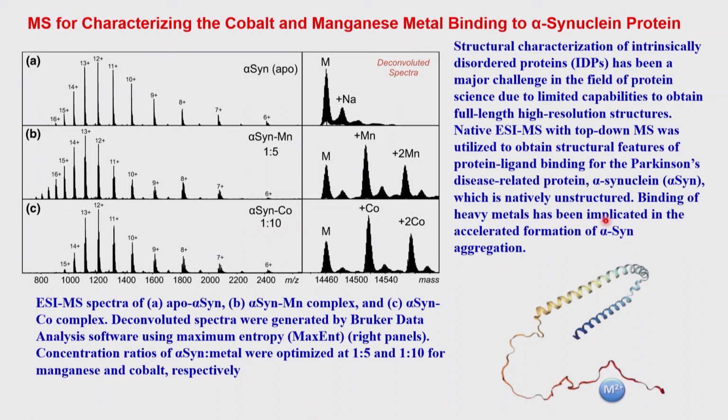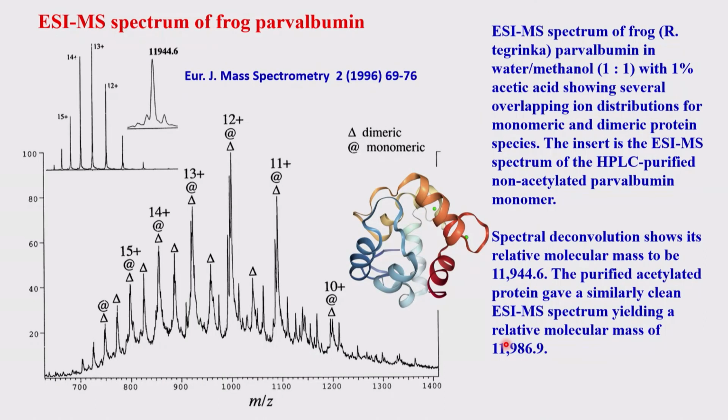So, okay, and these cobalt-bound or manganese-bound ones will show the aggregation, because this metal ion binding will make this disordered portion of the protein an ordered protein, and with the ordering they promote the aggregation of this. Okay, not only that, you can also do some reactions.